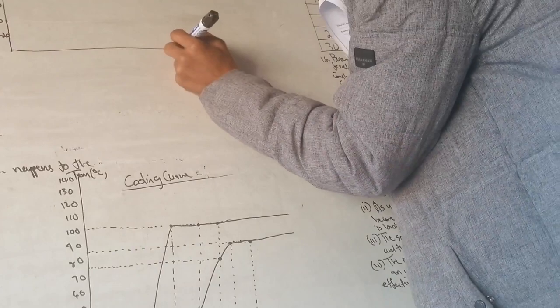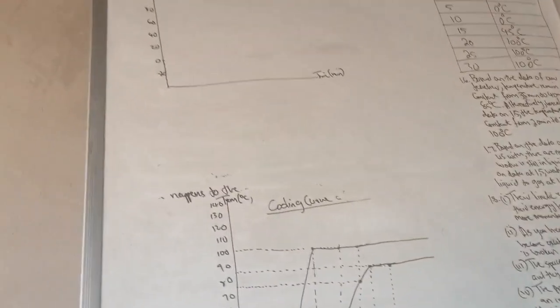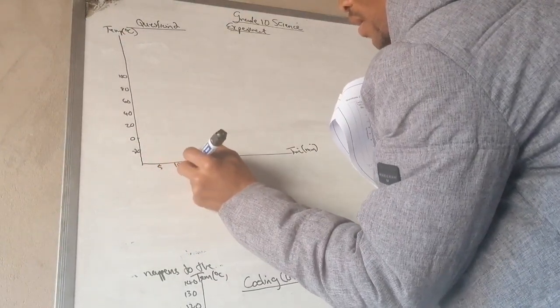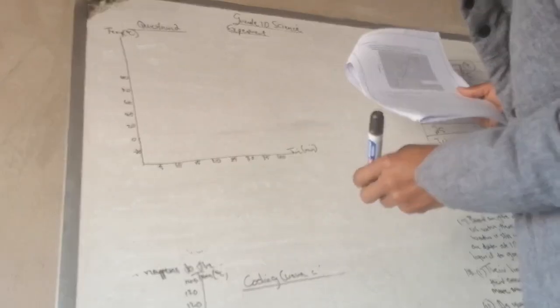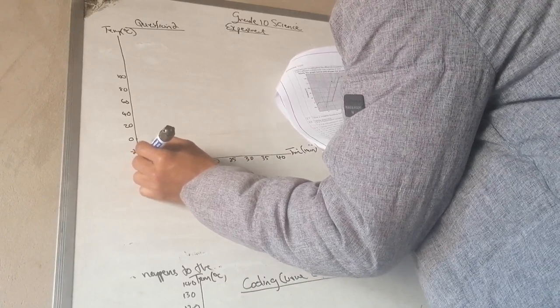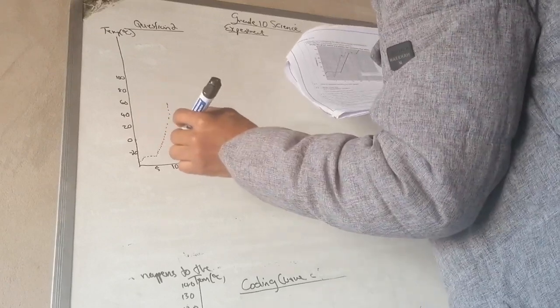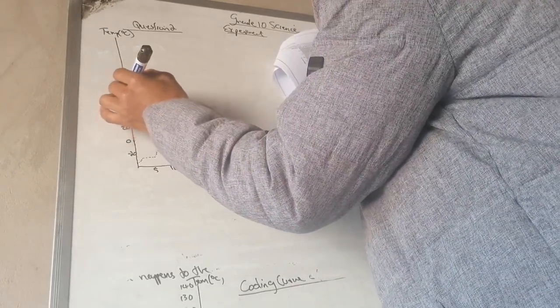Okay, so I have my time in minutes, and I have 5, 10, 15, 20, 25, 30, 35, 40. At 5, it will rise, and this is 80, something like this.